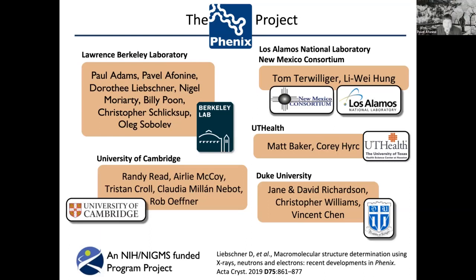Yeah, it's a complex topic, of course. I would still think that standard traditional model validation tools are important. Once again, look at an alpha helix. It has a geometry, and that geometry should not vary depending on what method you used to obtain it, whether crystallography, prediction, or cryo-EM. There's no reason why an alpha helix suddenly shouldn't look like an alpha helix because you used prediction. That is my logic to say that standard validation methods still apply for predicted models.